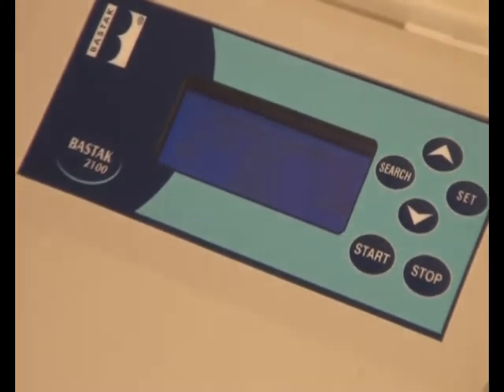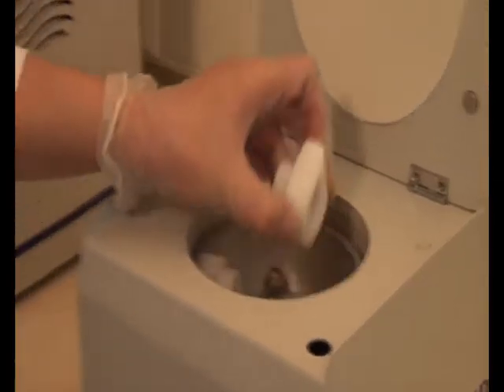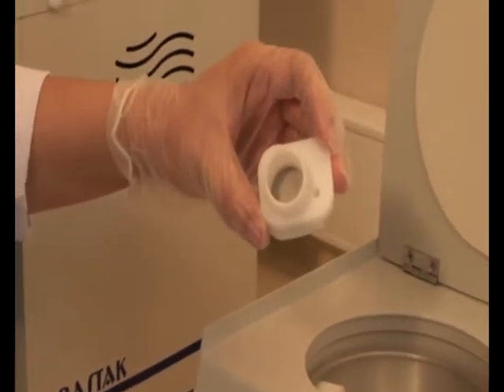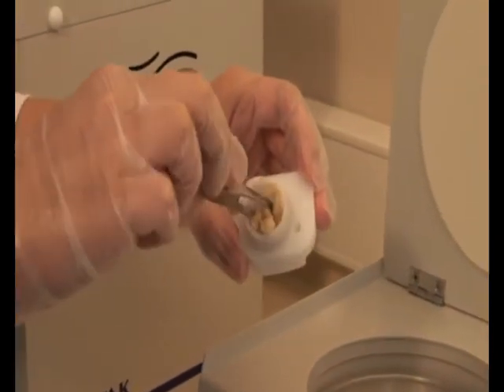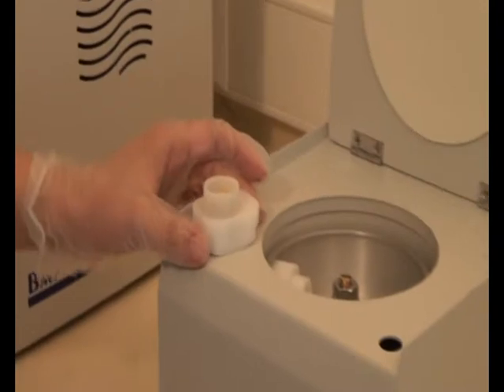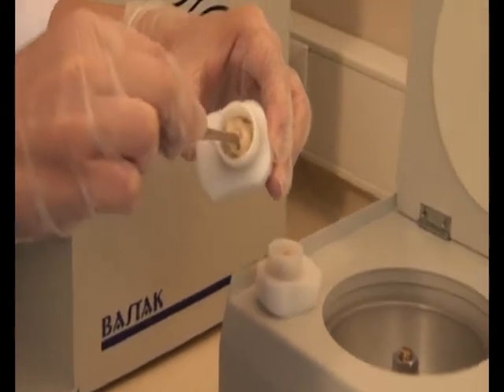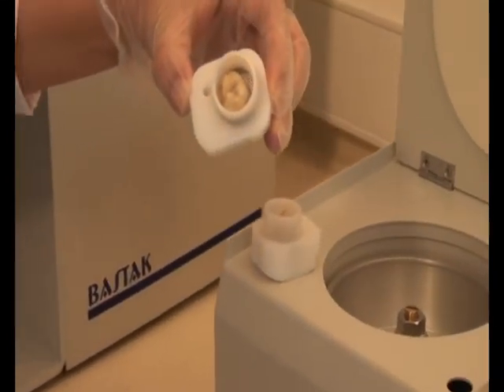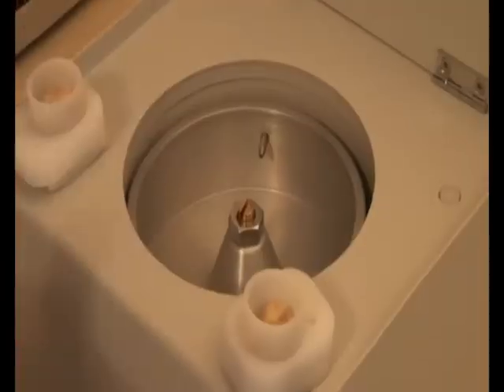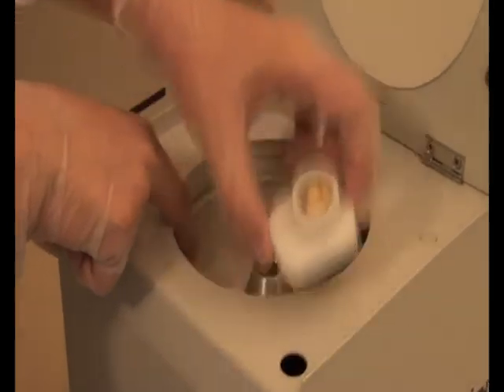When the ready sign is seen on the screen of the instrument, open the cover and take out the cartridges. Place the wet gluten samples inside, then place the cartridges back into the instrument. Both cartridges should be filled with a similar weight of samples.